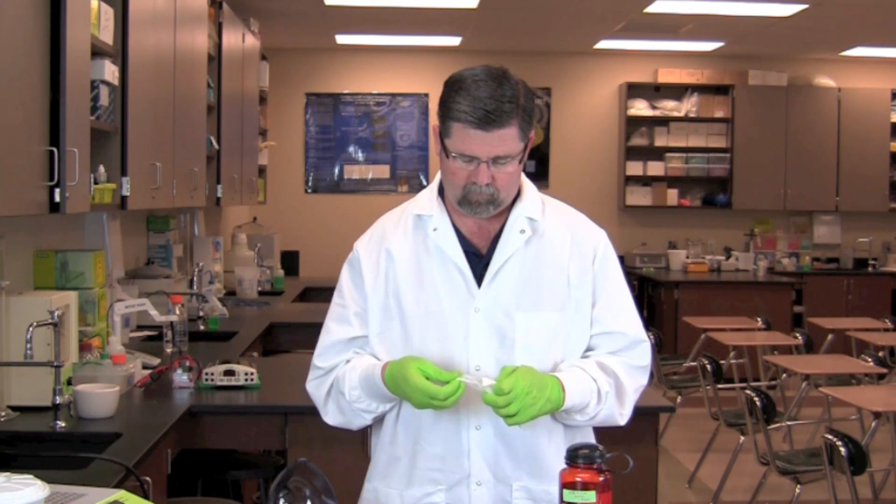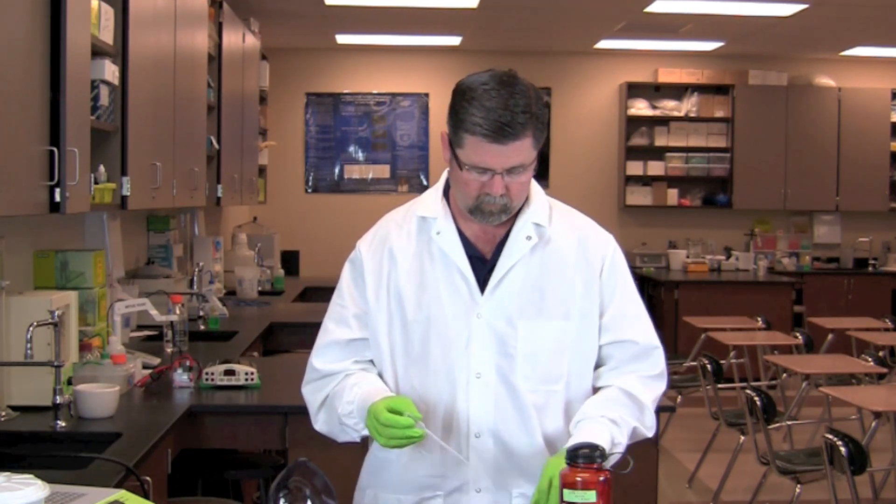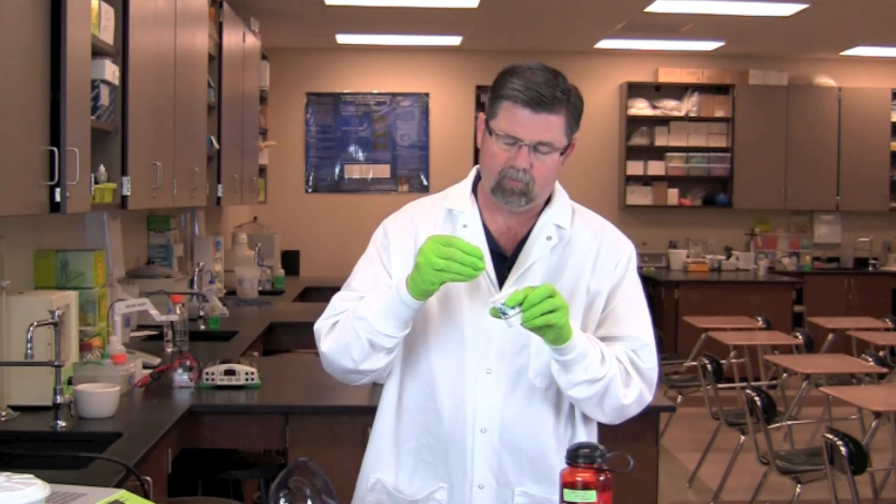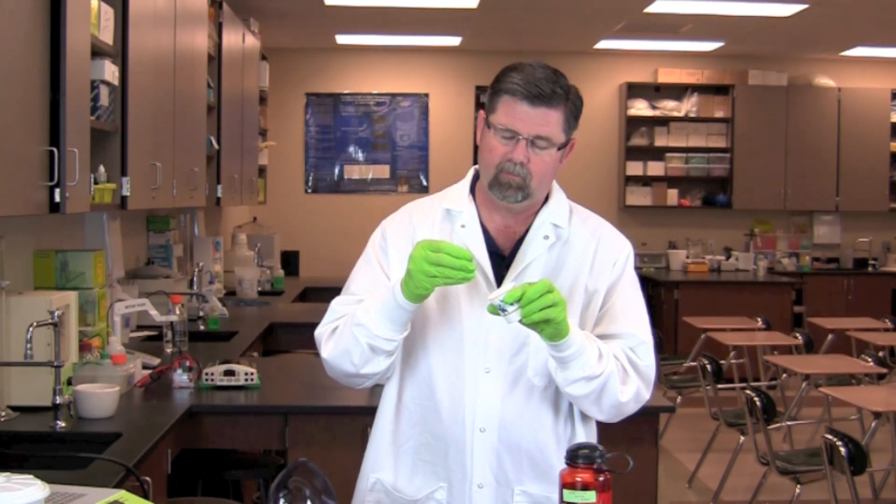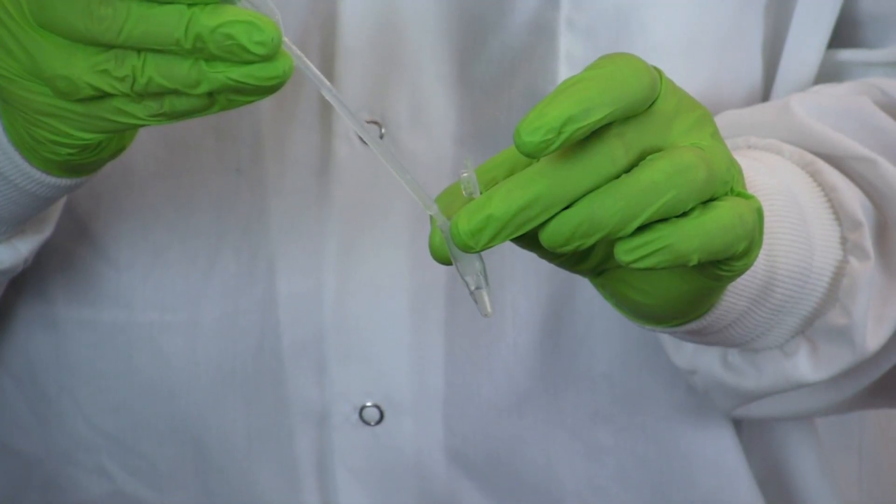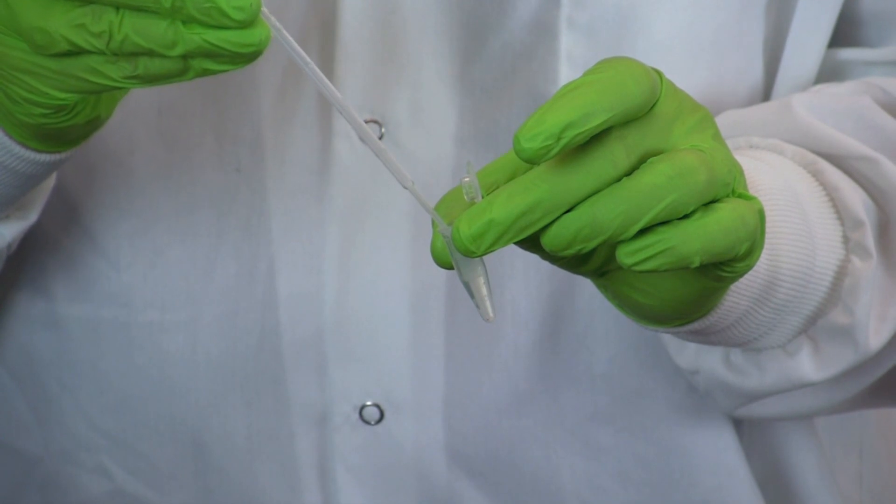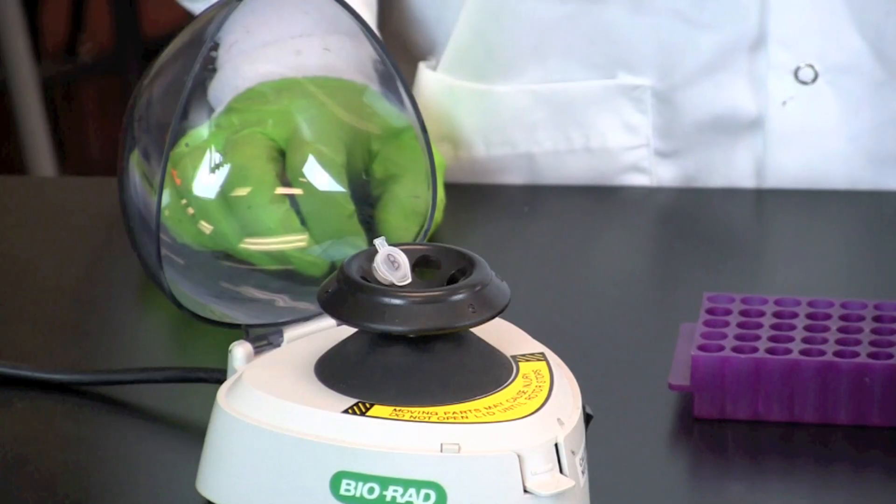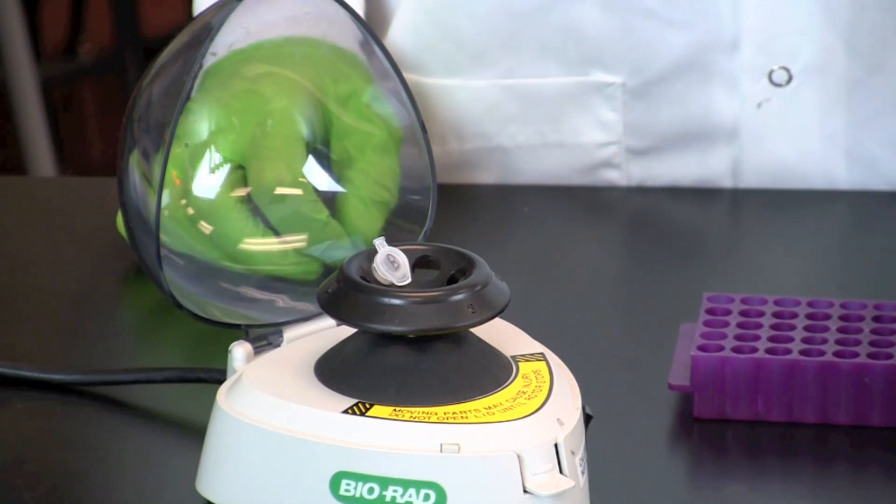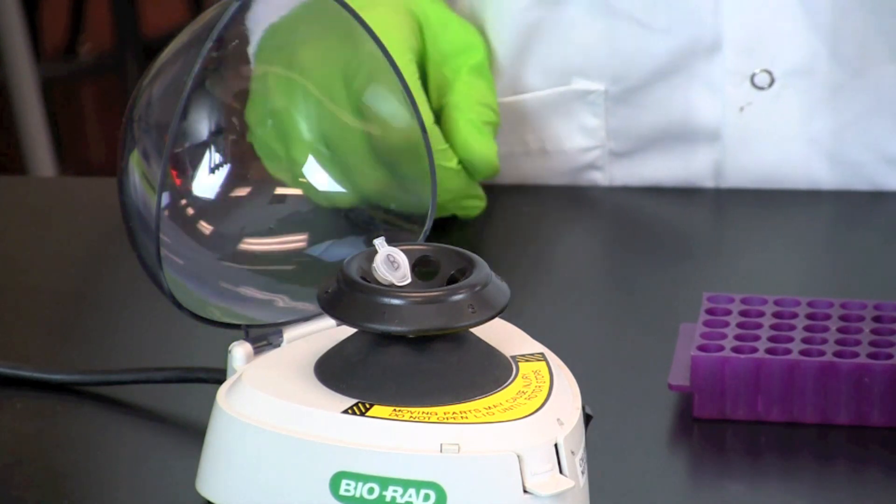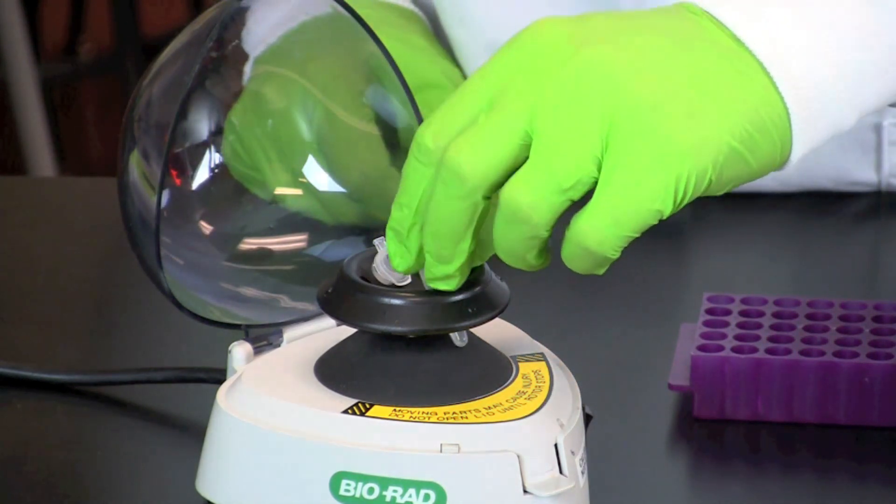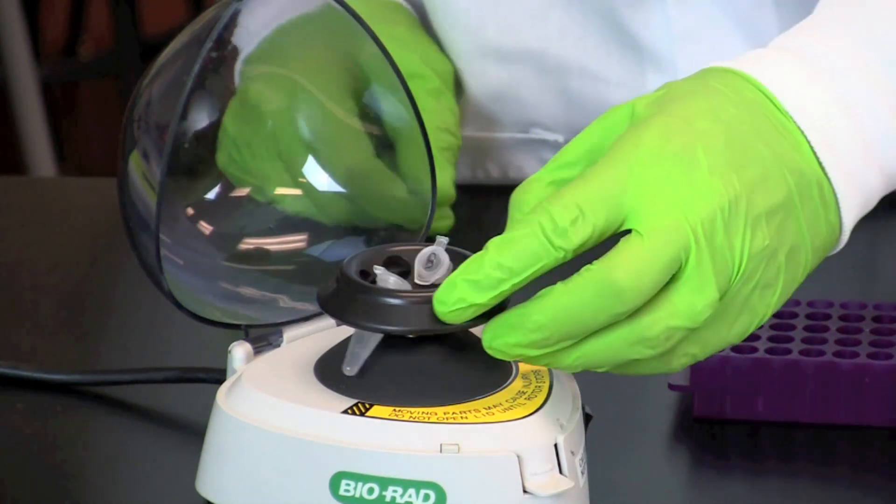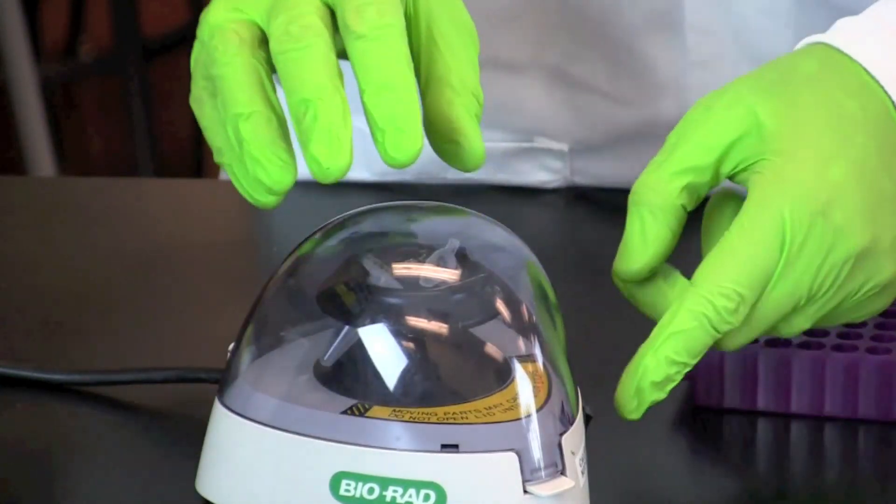Pipet 1 milliliter of mouth rinse into a 1.5 milliliter flip top microcentrifuge tube. Place the tube into the microcentrifuge in a balanced configuration. Place the hinges of the tubes facing outward so that the pellet will be easy to locate after spinning.